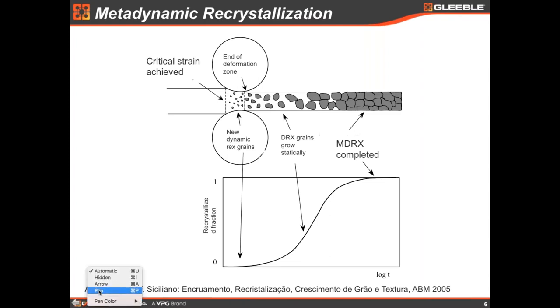So this is the basic difference. The reason that we differentiate is that someone might say, oh, but this is just like static recrystallization. Yes, but there's a slow area in the kinetics curve. There's a very low kinetics area here, and this is avoided when you have the grains dynamically nucleated. So basically, this area here, if you look at static recrystallization, is much longer.